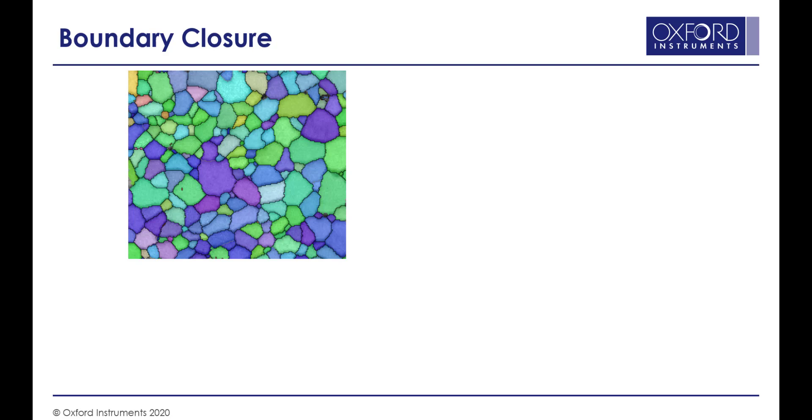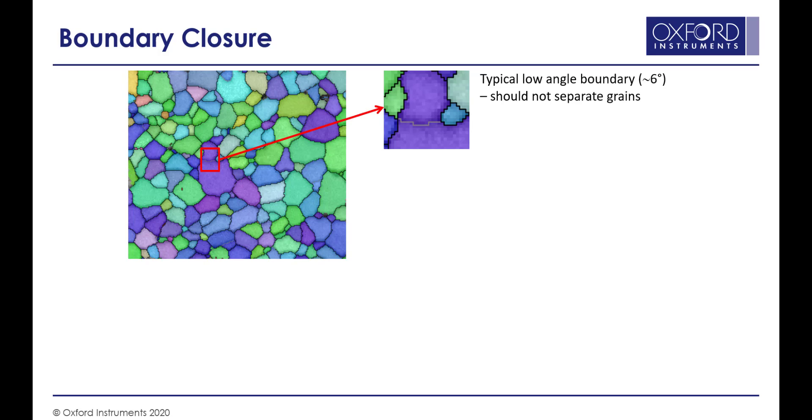Here we're looking at an orientation map of a recrystallized magnesium sample. If we look in the central dark blue grain, we can see that within the upper part of that grain, we have a typical low angle boundary, or subgrain boundary, with a disorientation of about 6 degrees.